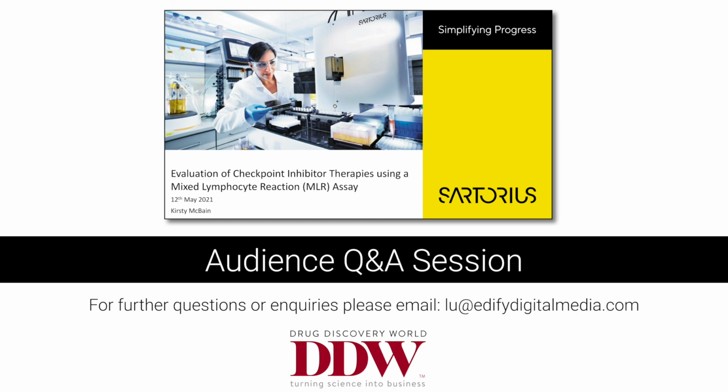Another question: in two-way MLR, could you label in a way that allows proliferation of T cells from each donor to be distinguished? Yes, you could. There are 3 different proliferation encoding dye kits in the iQue portfolio, and each fits in one of the violet, blue, and red channels.